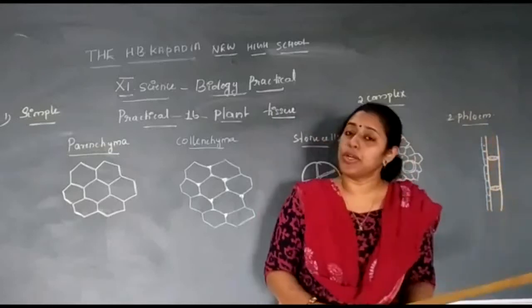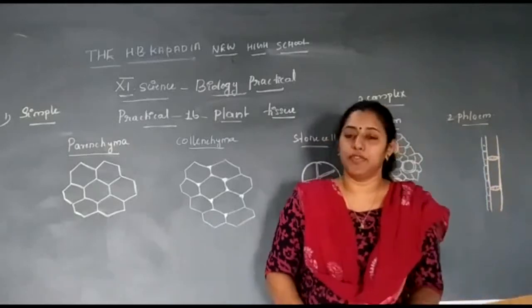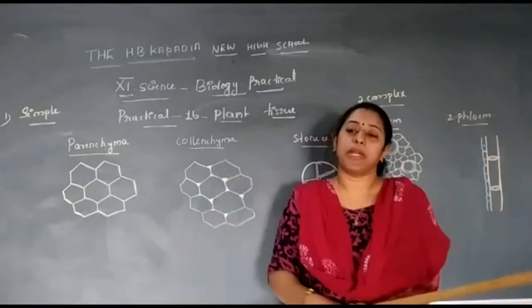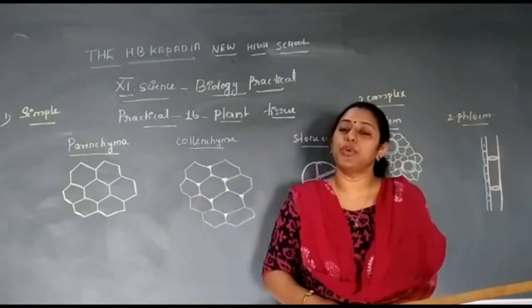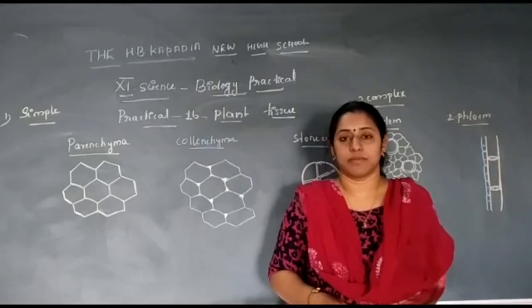Companion cells are nucleated and they are controlling the functions of the sieve tube cell. So this is an overview of the practical. Now I am going to show you each slide one by one. So students, now I am going to show you the slides one by one.